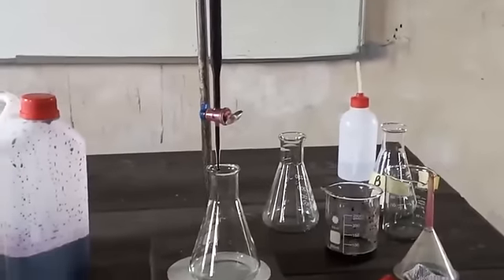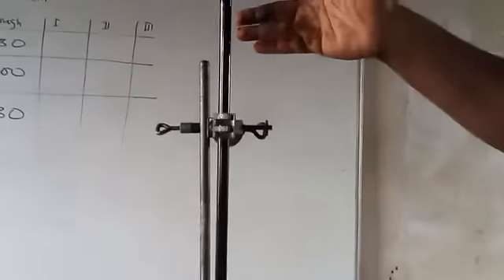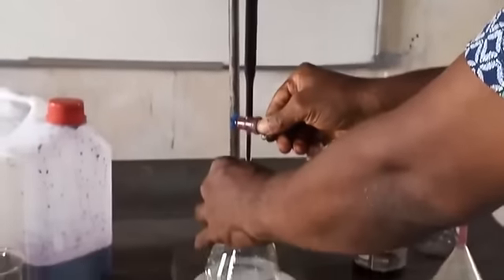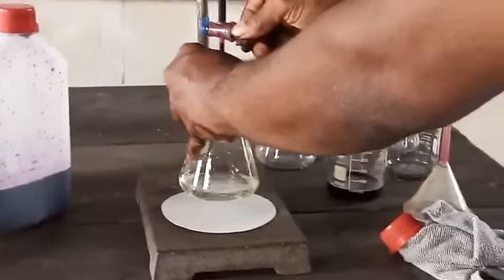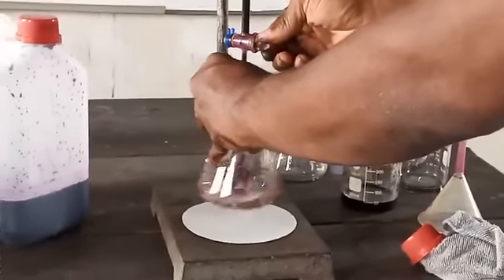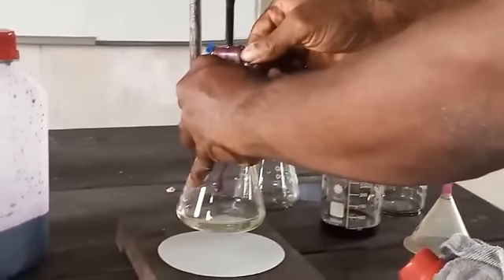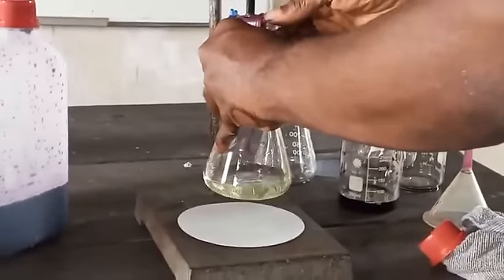So we are starting the first titration now, having done the rough. We still have enough permanganate in the burette. So we're starting around 3.34 as the initial reading. I will titrate into the acidified iron 2 sulfate. So we'll start this one again and see what will happen. We'll increase our speed a little, maybe adding two drops. Now, since I have an idea of where the color change is, we expect this one to change in the next 3.33.